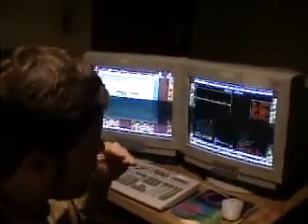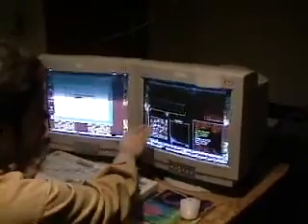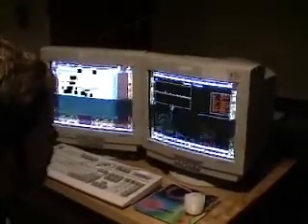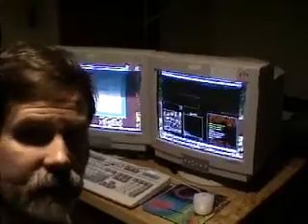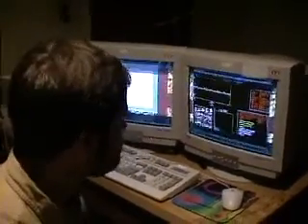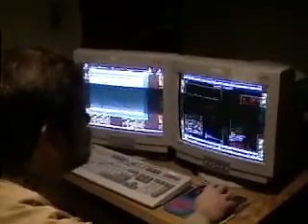Usually, if you're working with a flattened image, it is preferable to take a cross-section that's perfectly horizontal so that it will be affected as little as possible by the flattening process. If I had a step in my sample that was horizontal, the height of that step would be strongly affected by the flattening process. Whereas if I have a step that's vertical, the height of that is not affected by the flattening process. So when possible, you want to do a cross-section that's perfectly horizontal.